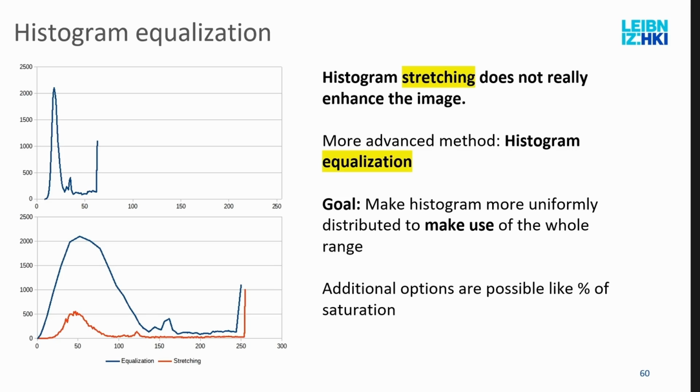Theoretically it will ensure that the histogram that comes out in the end is uniformly distributed. Obviously, it doesn't work because this is not uniformly distributed. But the idea behind this is to maximize information. So it comes from all this information theory, this histogram equalization. It's a very complicated algorithm, doesn't work perfectly.